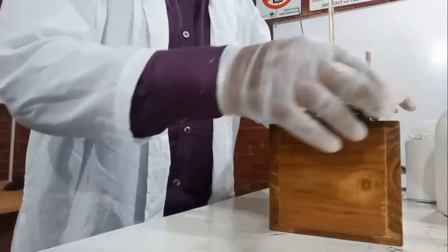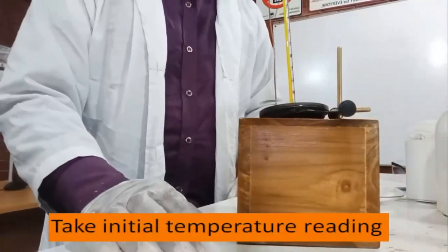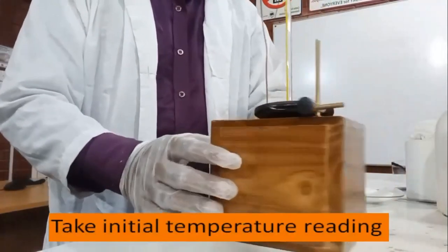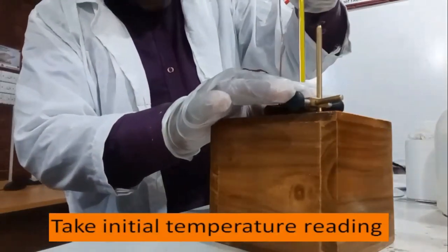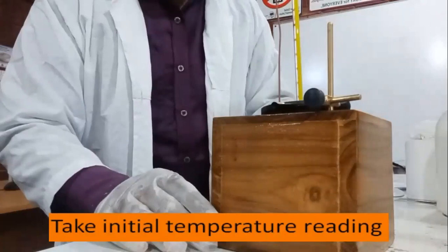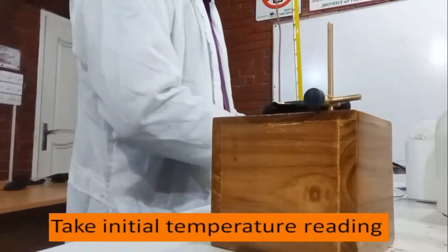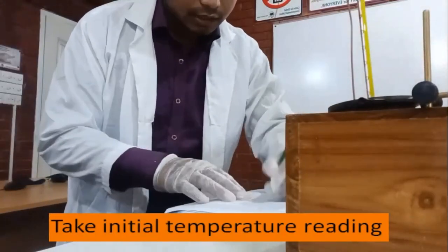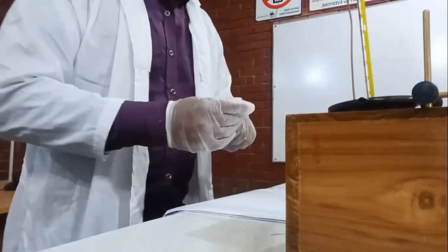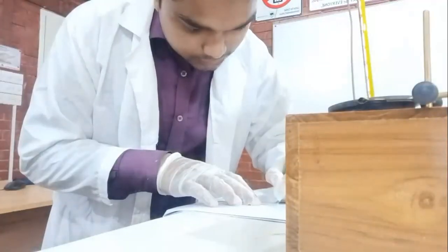After taking this 50 ml water in the calorimeter, I have to take the initial temperature reading. So our initial temperature is 30 degrees Celsius.